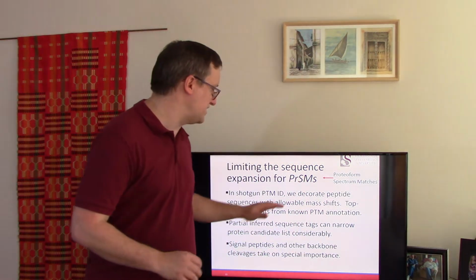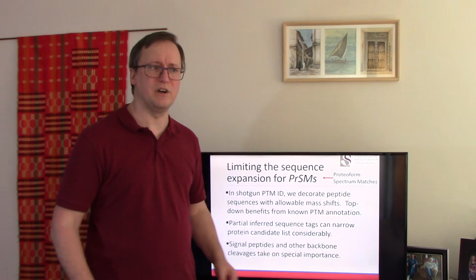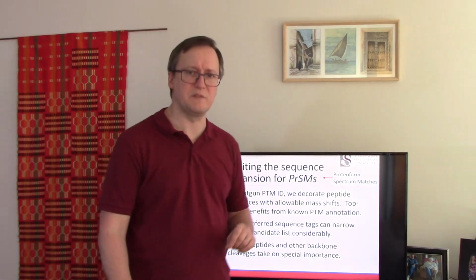As a result, you probably need to take into consideration the possibility that you have one methionine oxidized, 2 methionines oxidized, 3 methionines oxidized, and by the time you get up to the content of 5 or 6 methionines, the different patterns you have to consider just for the possibilities where 3 of them are oxidized becomes quite complex. So you can see that we have this huge expansion in the number of potential proteoform spectrum matches that we must consider.